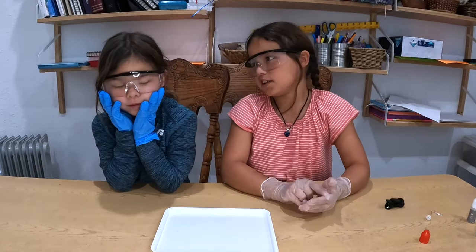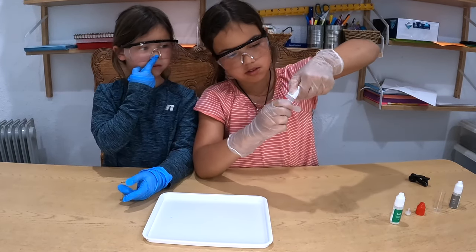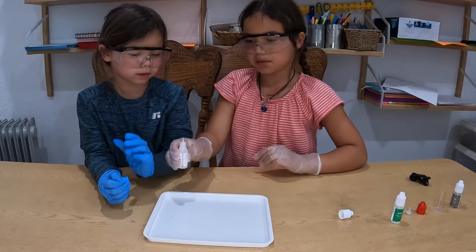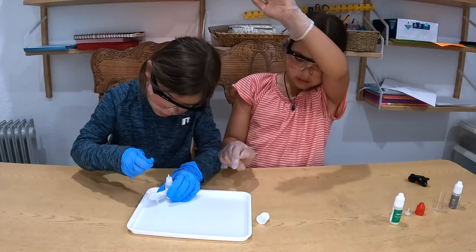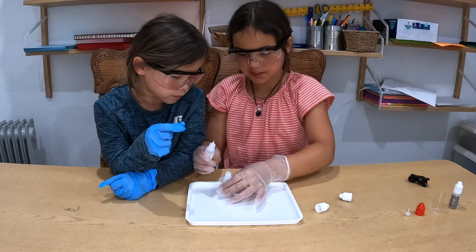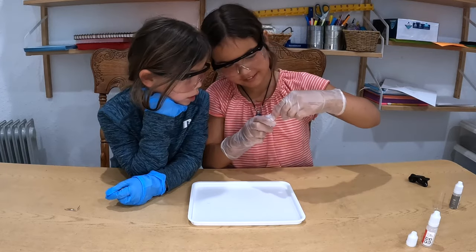First we need to prepare our tin chloride solution. We take the sodium sulfate and open it — if you're having a little trouble opening it, you just need to push it down and twist. There's a little cotton in it. Now take the tin chloride and squirt all of it in. Put the cap on, then put the red cap on and shake it.